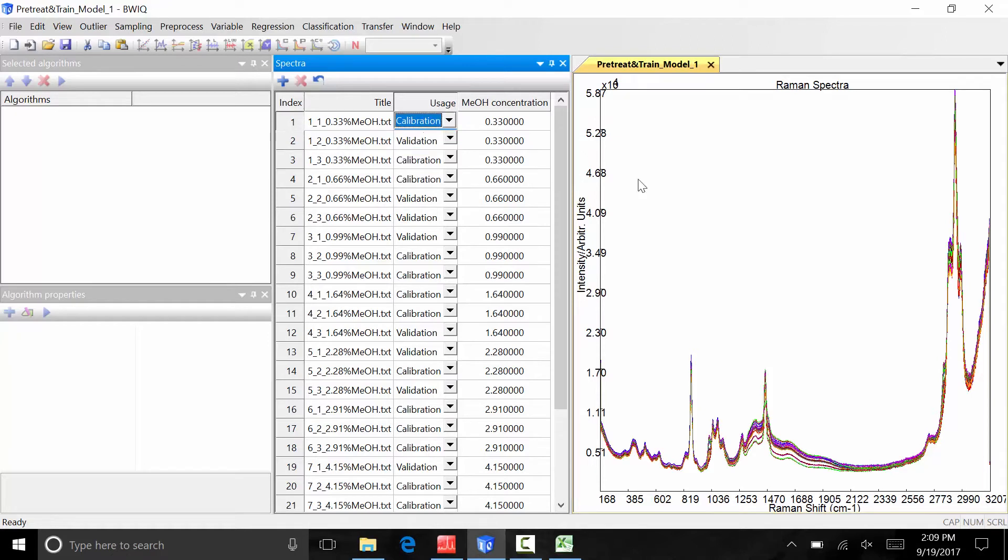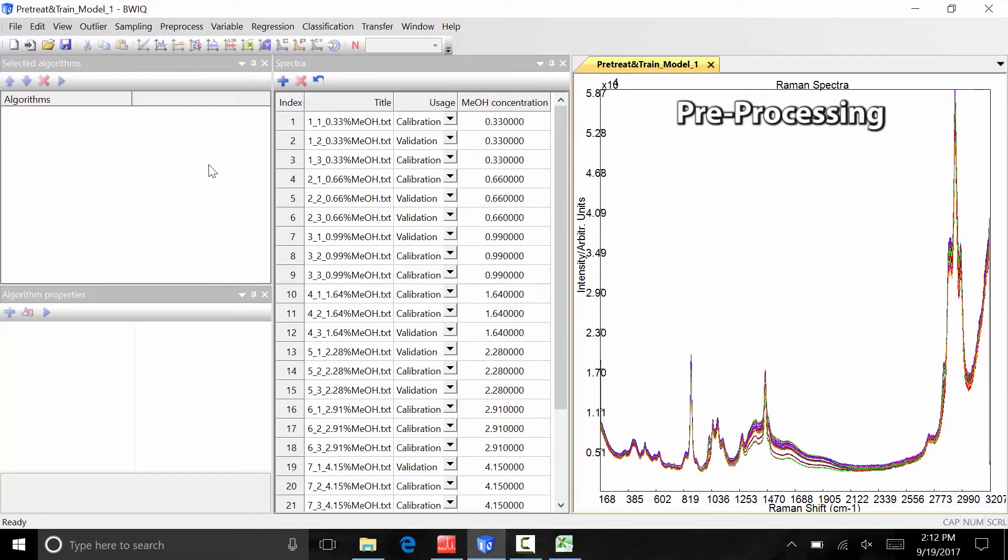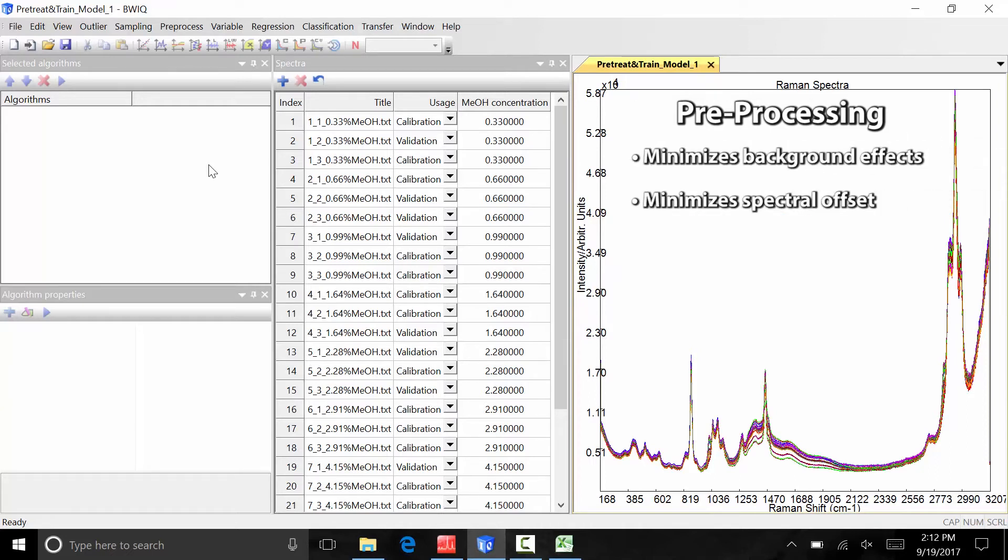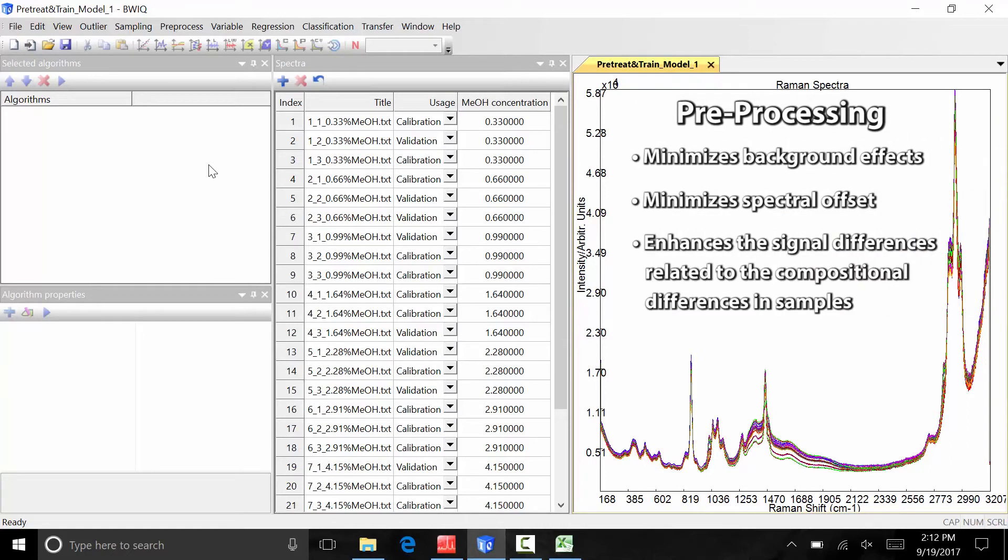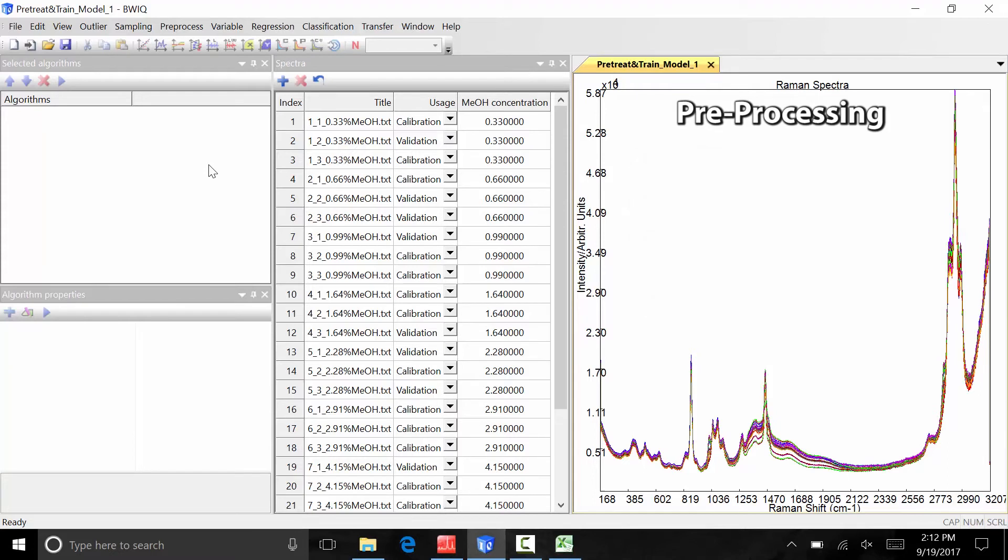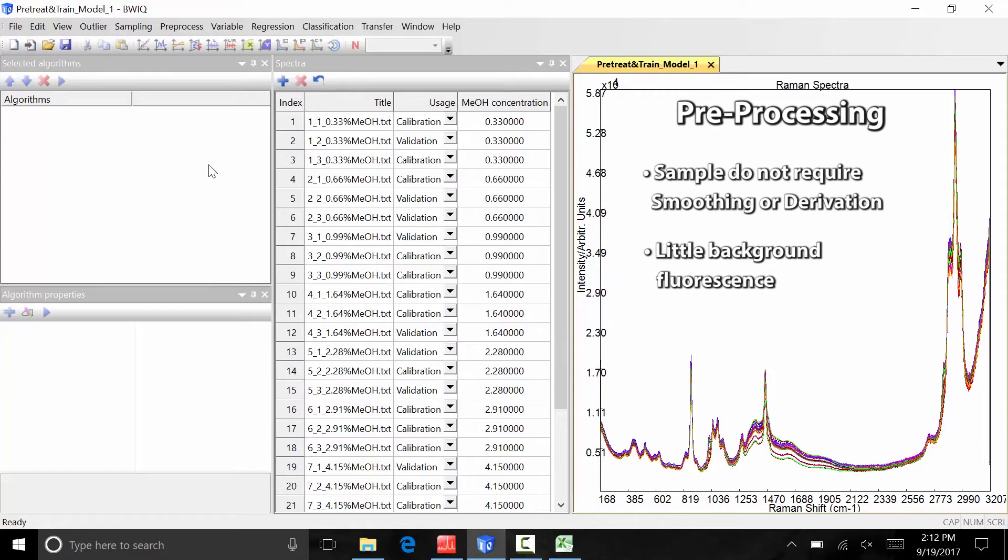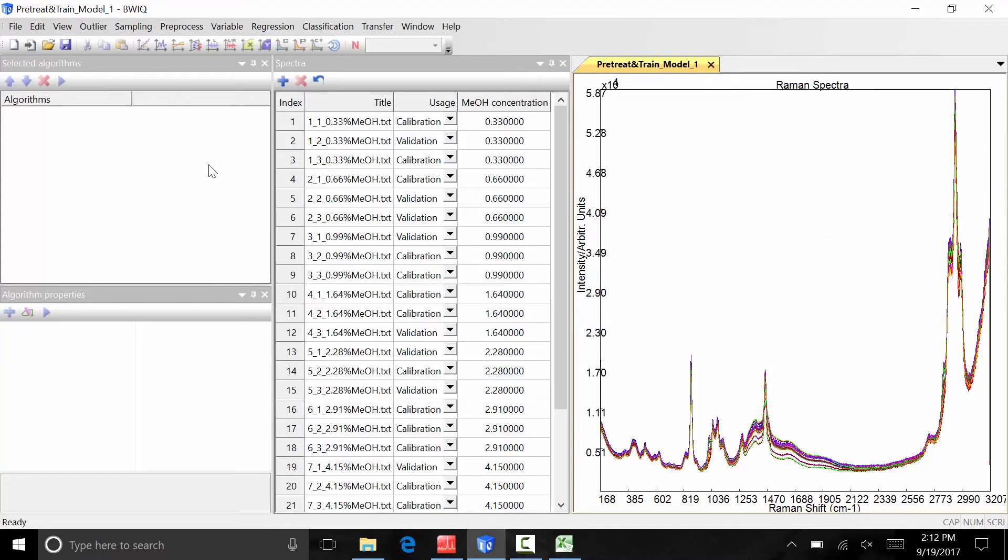BWIQ software has several data pre-processing options including smoothing, derivatives, and normalization algorithms. Pre-processing is typically applied in order to minimize background effects, spectral offset, and to enhance the signal differences related to the compositional differences in samples. Due to the simple matrix of these samples, these spectra do not require smoothing or derivation and there is very little background fluorescence. However, the baselines of this data set are offset between the spectra. We will apply a multiplicative scatter correction to minimize the effects of the baseline offset on the data.